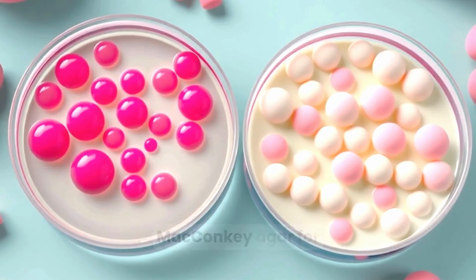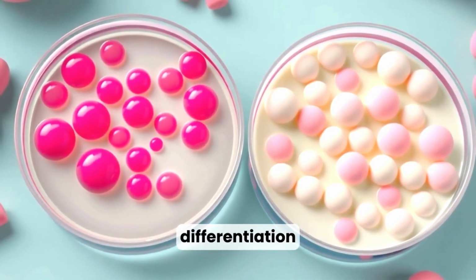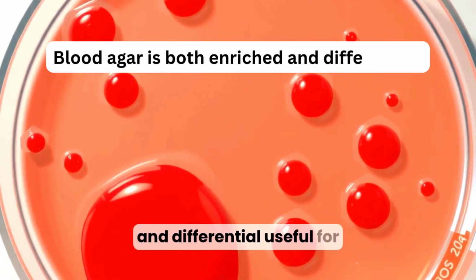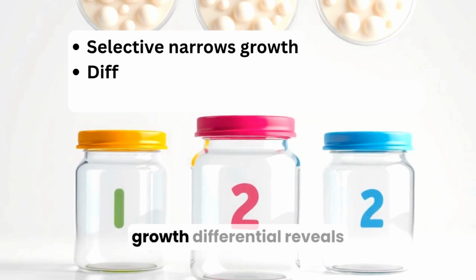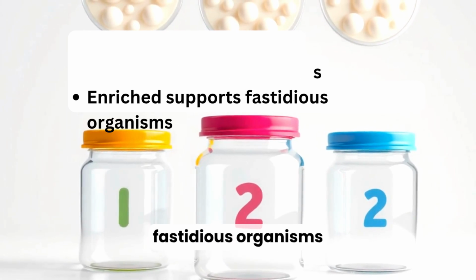Common examples include MacConkey agar for gram-negative selection and lactose fermentation differentiation. Blood agar is both enriched and differential, useful for detecting hemolysis patterns that help identification. Remember, selective narrows growth, differential reveals features, enriched supports fastidious organisms.